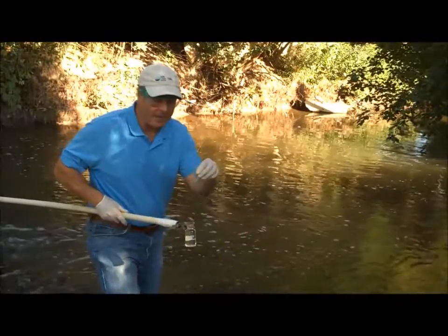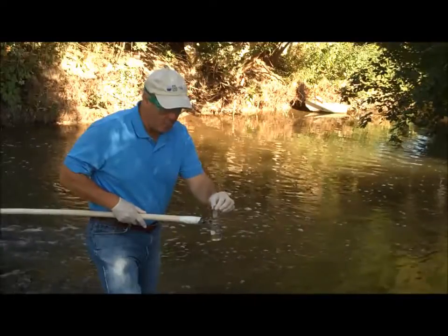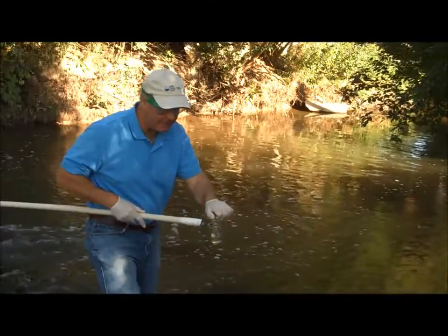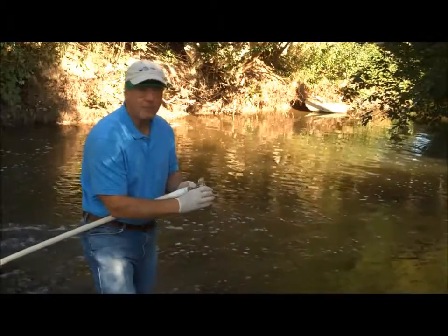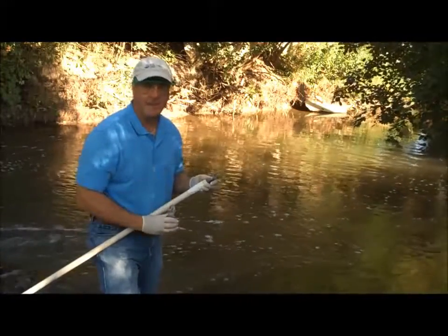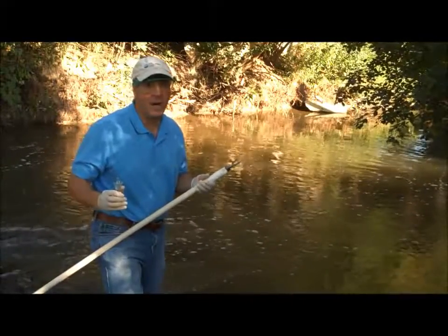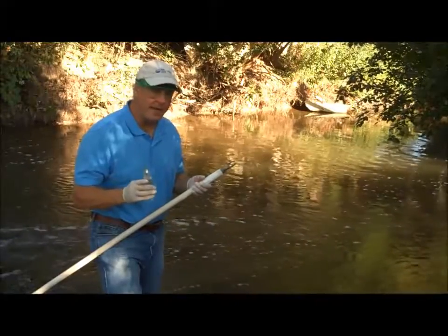When you cap it, you want to put the cap down and prevent any air bubbles from getting in it. Right straight down. There'll be a little bit of water that spills out. That's absolutely fine. And there's your water sample. If you need to take multiple water samples, you'll unhook this, you'll give it to one of your partners, and then you'll collect the next water sample, and so on. That's all there is to it to get the water, and then doing the test is up to you. That'll be on the remaining tapes.